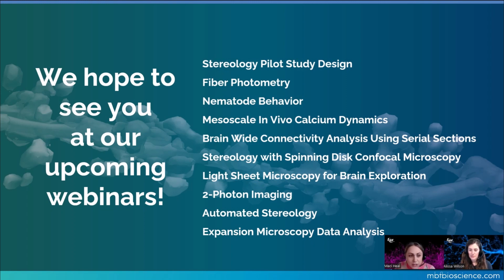So if you're a current Neurolucida 360 owner, you want to give it a try, we're happy to set you up with a free trial. We'll answer another question about whether you can download the software. We offer online demonstrations and free trials of the software, for current customers as well, but new people too.